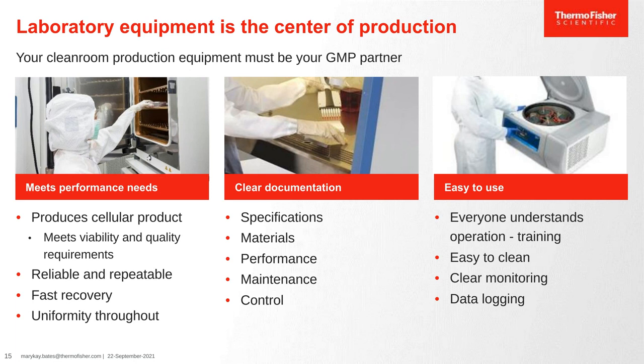So as an example, for an incubator or a freezer, that means that you have to have fast recovery from a door opening so that the cells are in their ideal conditions as much as possible to ensure proper cell growth. If you're talking about a freezer, you want fast recovery from a door opening because even if your cells or your reagents in the freezer don't literally thaw, just warming up a little bit can affect how they freeze and can affect viability when you thaw those cells out.